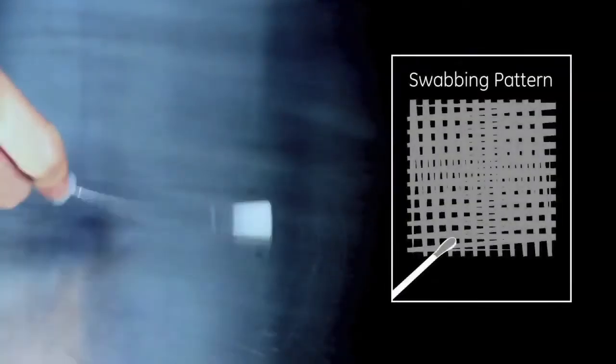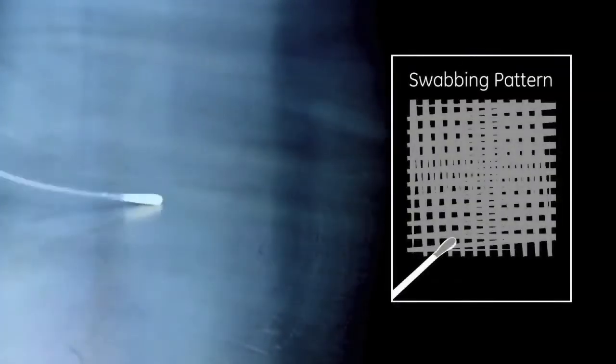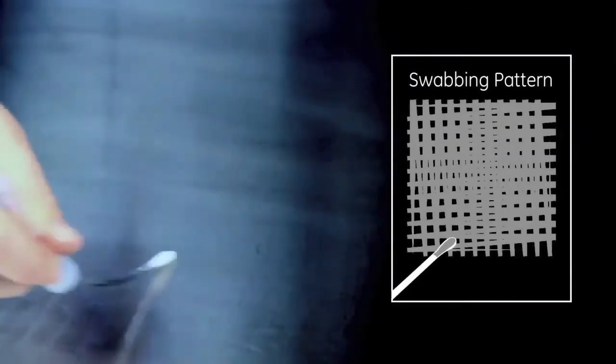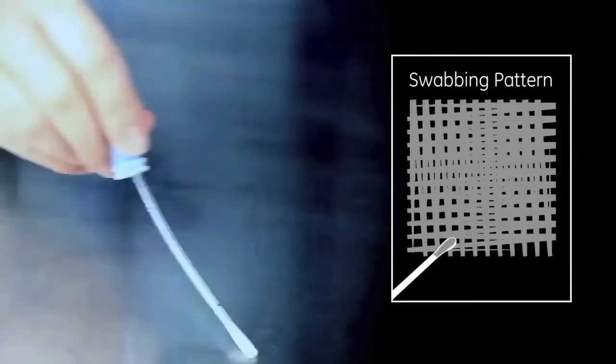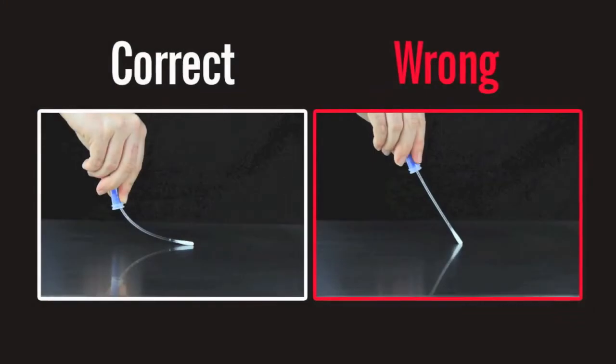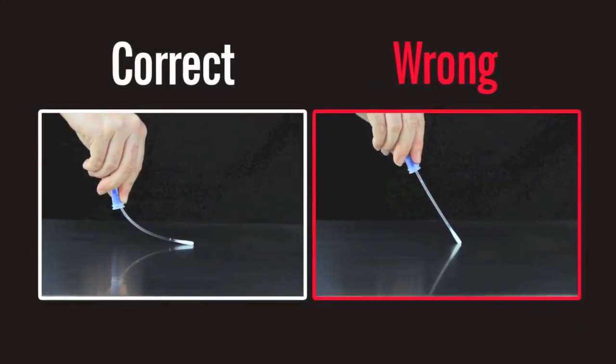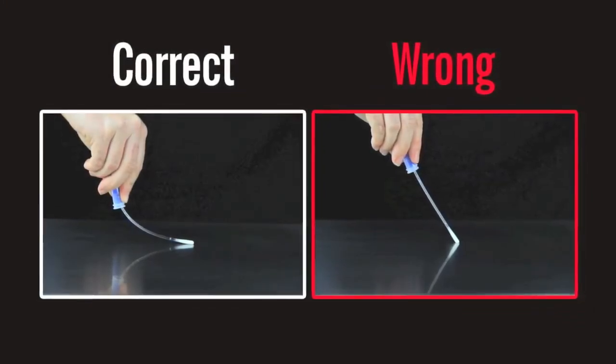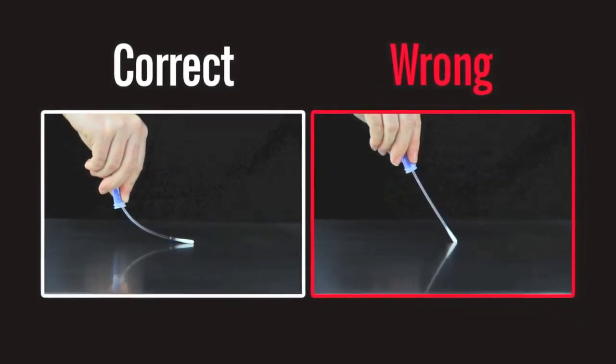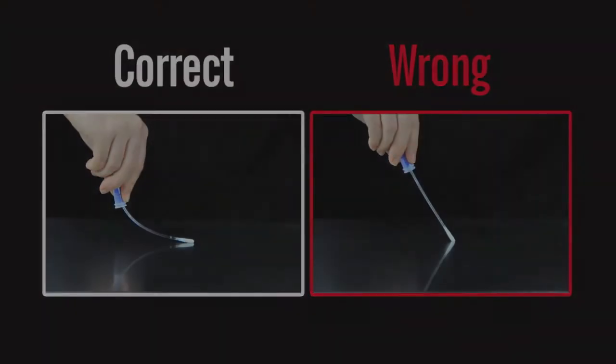Swab a 4x4 inch or 10x10 cm square area in a criss-cross pattern, swabbing the area with even coverage. Apply sufficient pressure to create flex in the swab shaft. This maximizes sample collection and improves accuracy of test results.